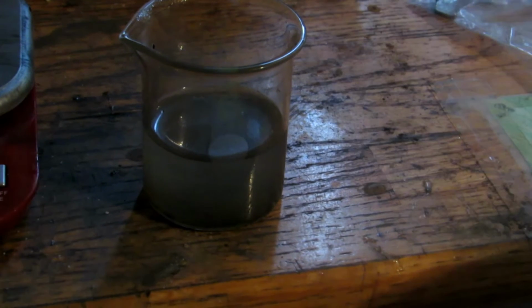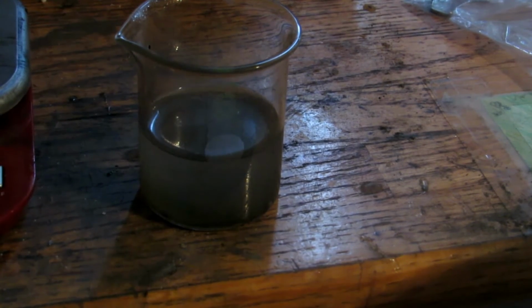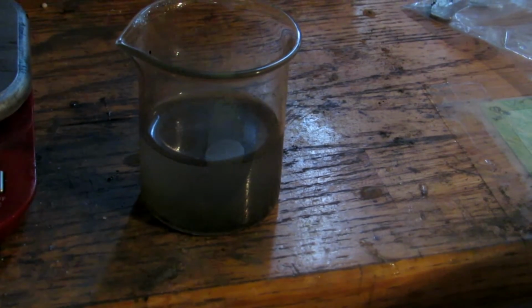So you can see there's lots of impurities floating in here. So what we can simply do is take this and filter them off. So that's the first step. So I'll go ahead, get some filter paper, and filter it.